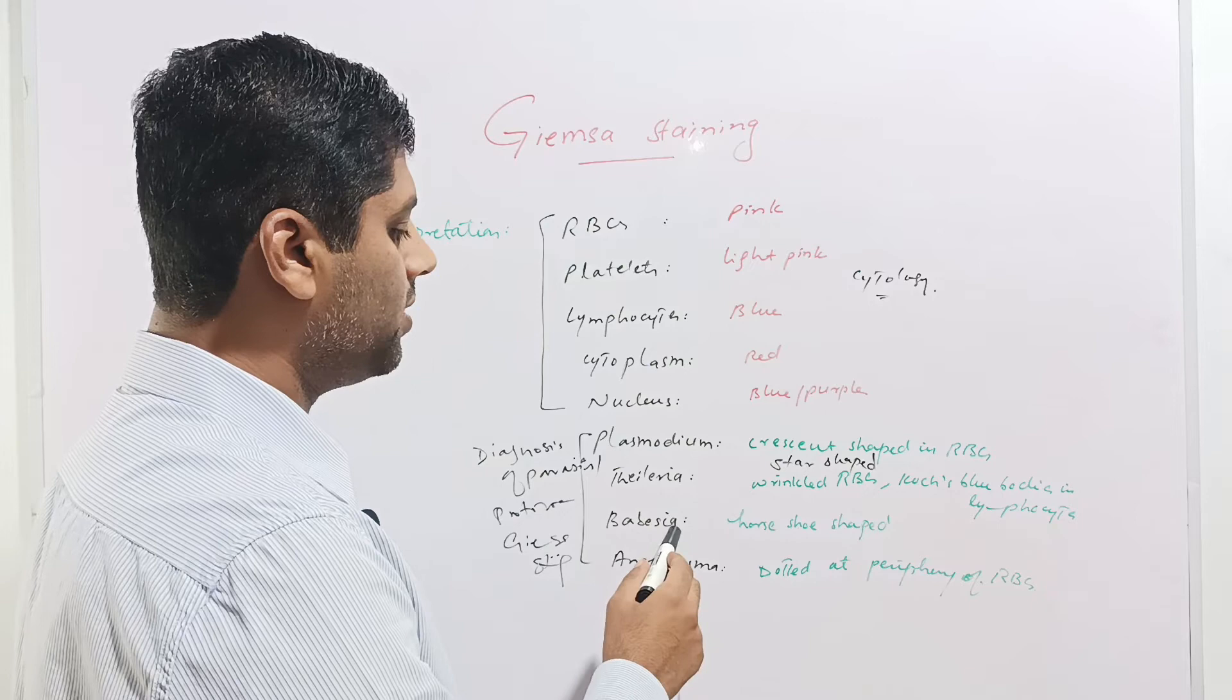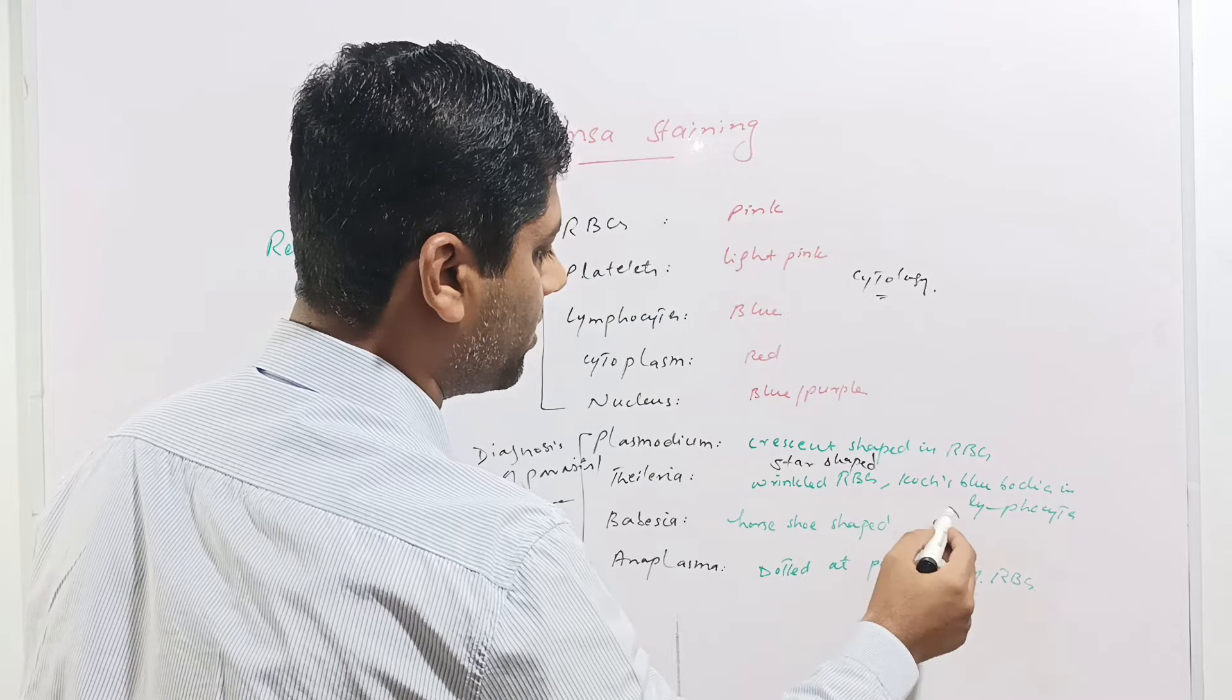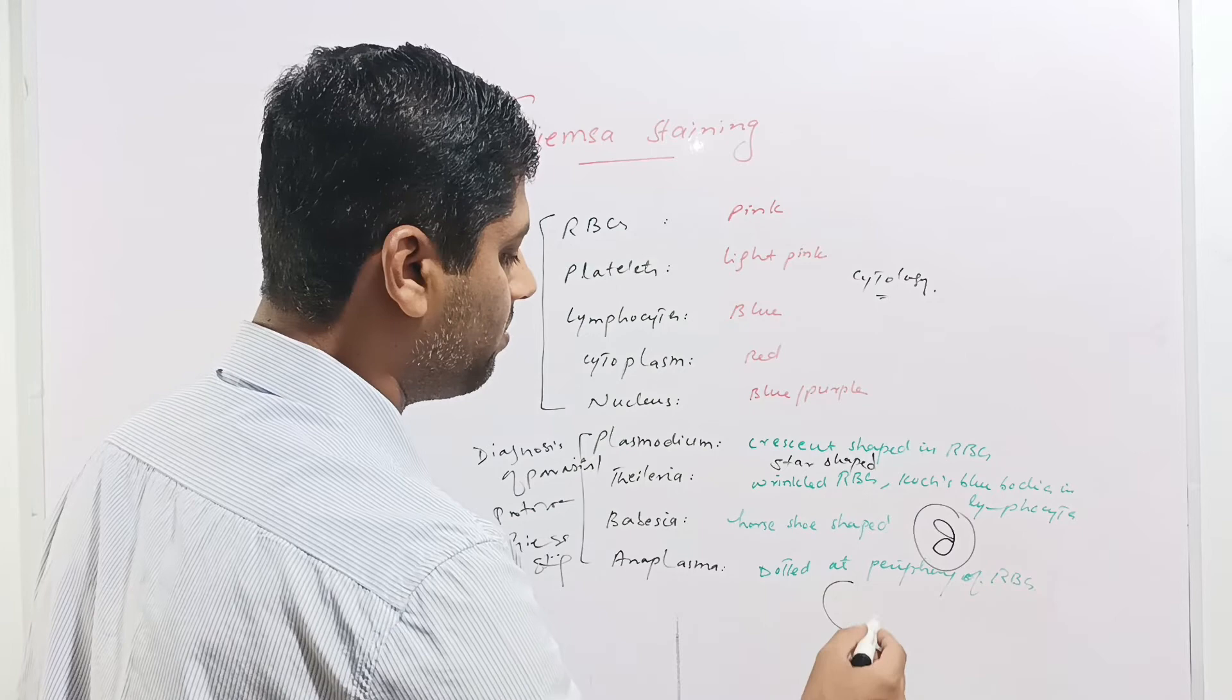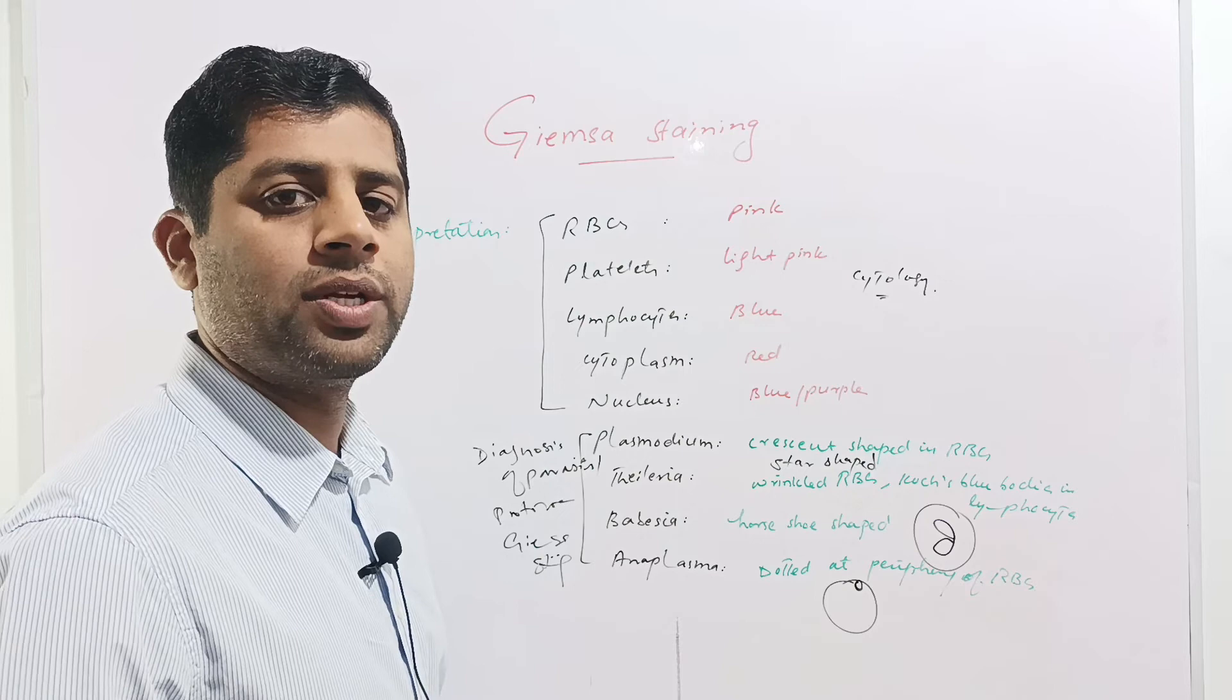Babesia is seen as horse shoe shaped in the red blood cells. This is the appearance of babesia in the red blood cell. Anaplasma is seen as dotted at the periphery of red blood cells. For example, this is the red blood cell and anaplasma is seen at the peripheral side of the red blood cell. These are diagnostic features of the parasites or protozoans using Giemsa staining technique.